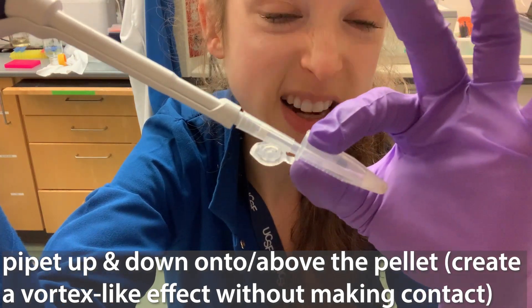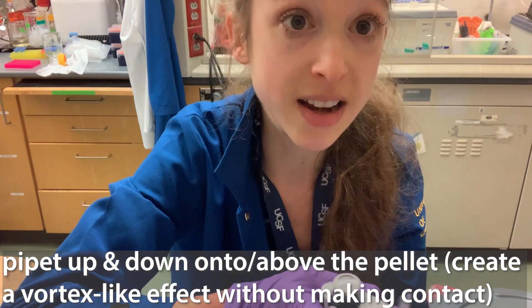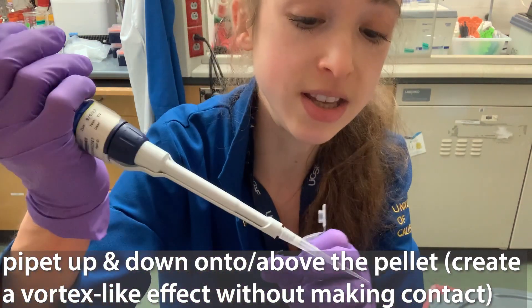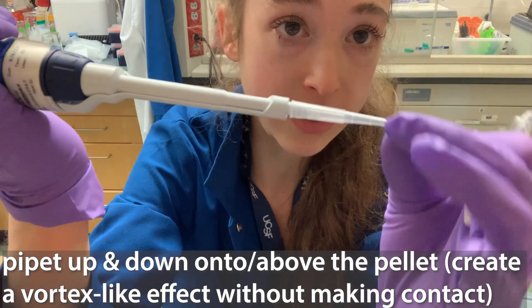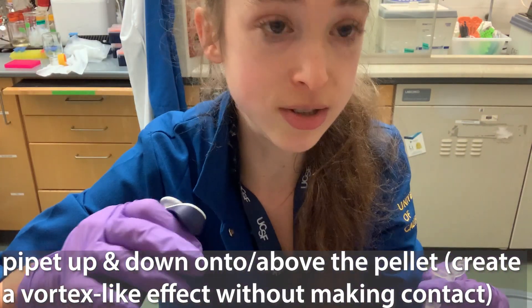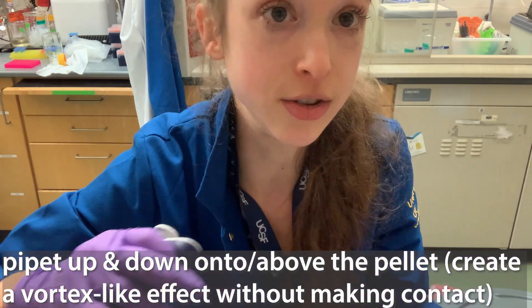If material gets stuck inside of the tip, what can happen is that you end up drawing up air and getting bubbles. And if you touch the outside of the tip, material can get stuck on there. You can also get pieces stuck inside. You're going to lose yield, you're going to lose pellet, and you're going to introduce bubbles.